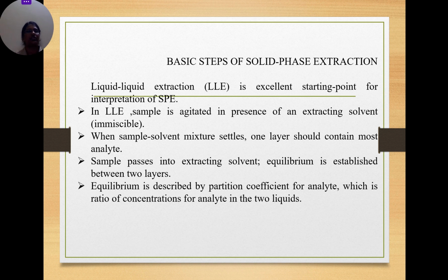When the sample-solvent mixture settles, one layer should contain most of the analyte. It's like a partition effect of the solvent, because whichever solvent gives a very good environment to the analyte, the analyte will shift towards that particular solvent. So it is a kind of partition between two solvents, and that's why LLE also plays a significant role in SPE.